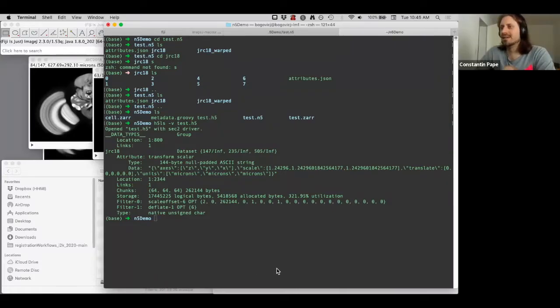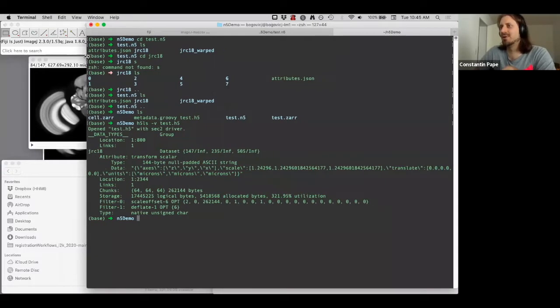Yeah, I agree it's strange to have this JSON encoded, but it supports arrays, this HDF5 dialect to write this metadata, right? So is there a reason not to just use this as, however you want to call it, a key value store where the values can also be arrays? For arrays, it's fine. It's just this is an object with keys and values at a particular key value.